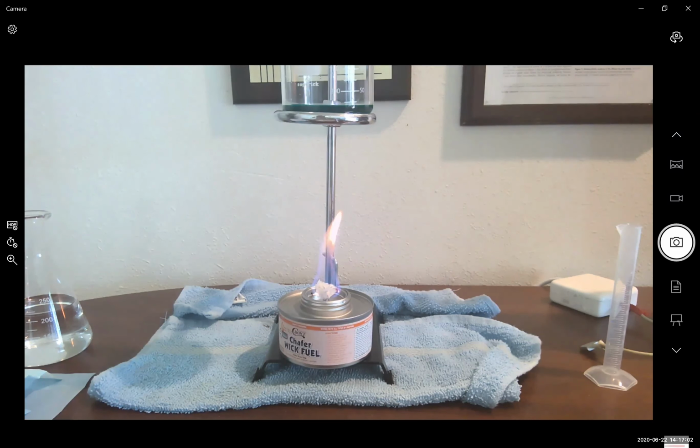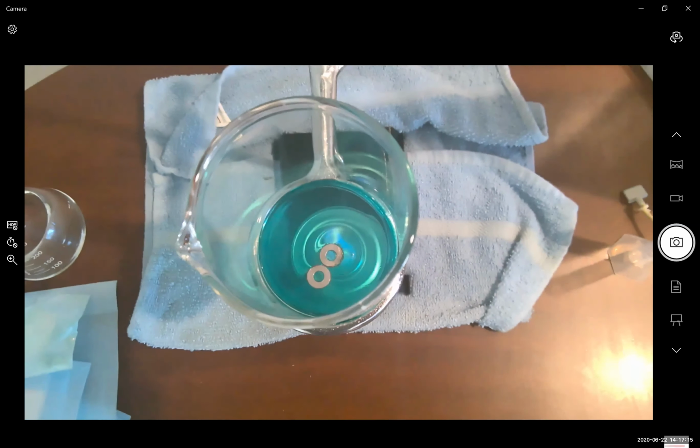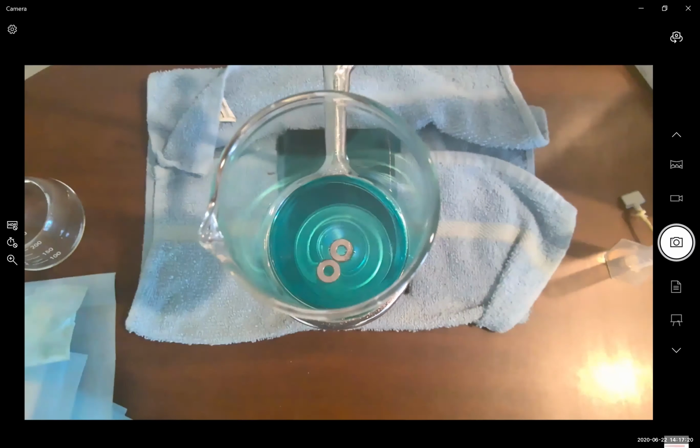Your sterno flame should now be leveling out. It should be a nice blue flame. It may not always be visible, but I have pretty bright lights, so it's easy to see. And what you'll notice, and we're already beginning to see it, does everyone see the bubbles that are starting to appear?